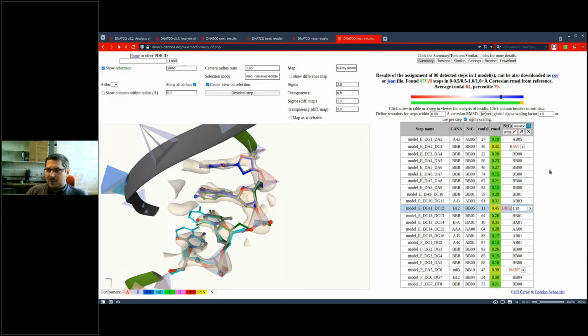It's just a snapshot of what it can do now. So you can basically change things, because here you can see that the RMSD is not so great, so maybe there is an alternative, as I showed before. So maybe we can try BA05 as an alternative conformation.